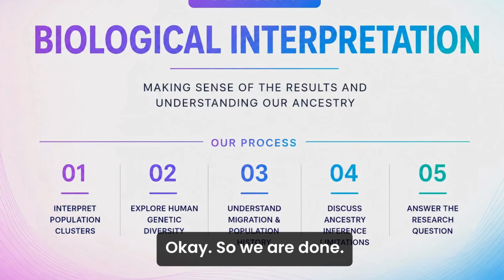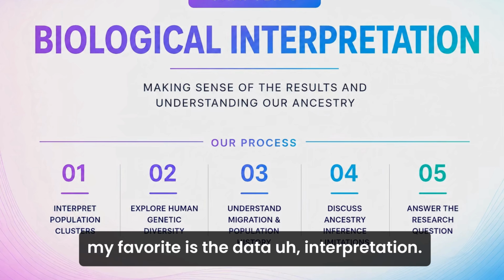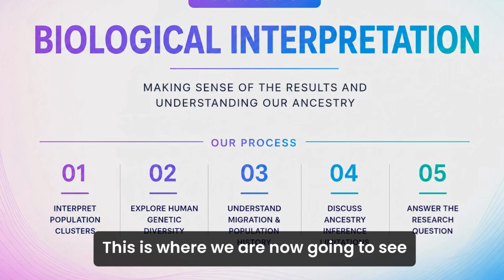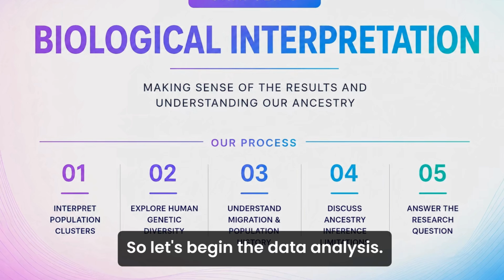Okay, so we are done. The very last chapter, which is quite my favorite, is the data interpretation. This is where we are now going to see what output we have got from this dataset. So let's begin the data analysis.